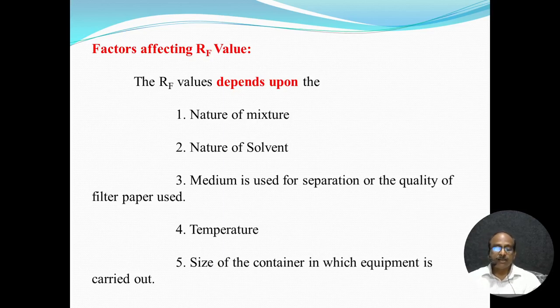In the similar manner, the quality of the filter paper used is a factor. Suppose you did not use good quality paper, automatically the RF value may change.